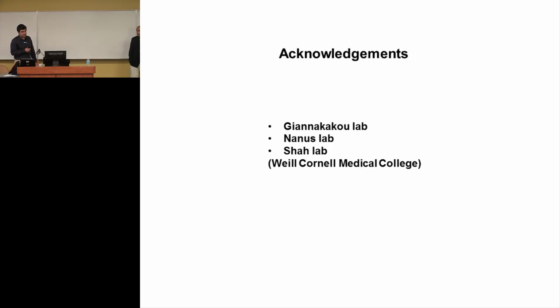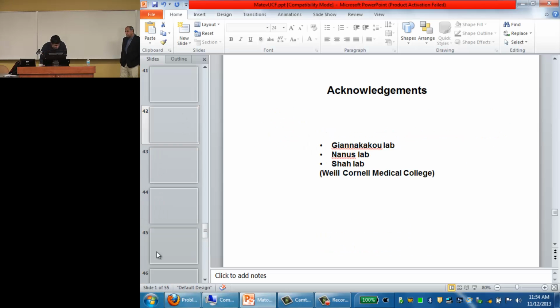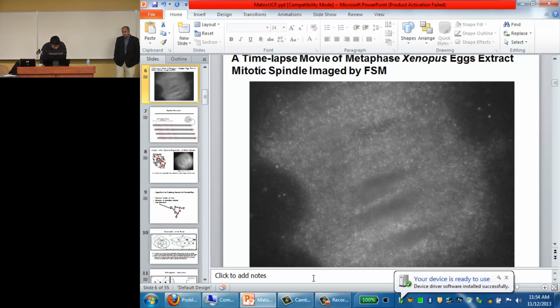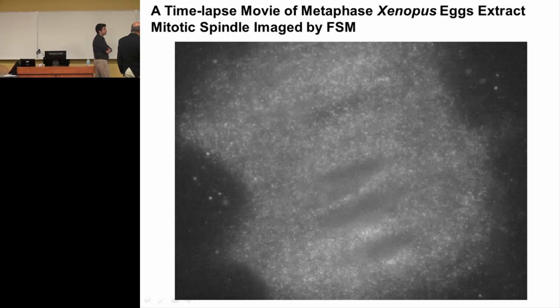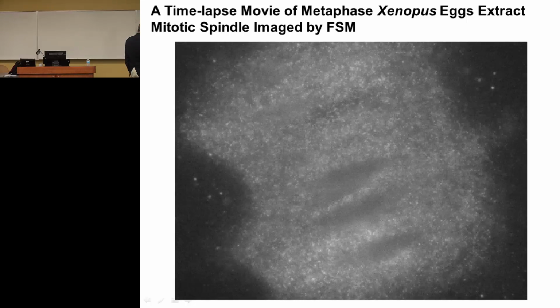So by definition, it's a one pixel feature. So I see what you mean. The problem is that there is really high density, right? There's really high density. If you look at the one movie which I showed before, you can imagine how you would map them. For instance, in each of these pixels you see there are differences in intensity value, which is the way we as humans track them, or probably take into account.